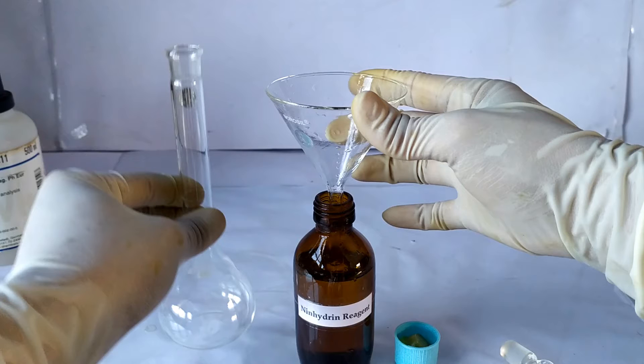There are various formulations for preparing the reagent. I'll be showing you here the protocol for preparing 100 ml of a 2% ninhydrin reagent.